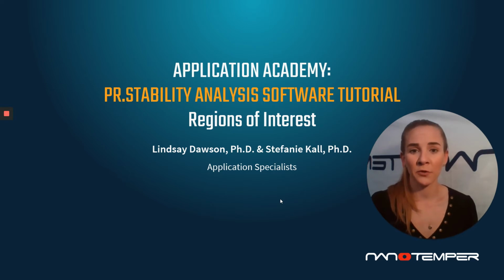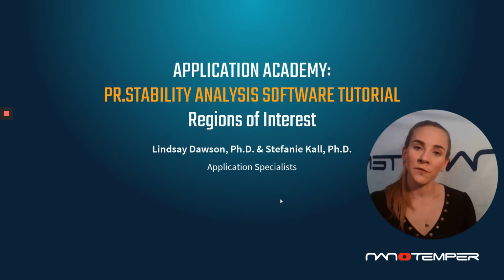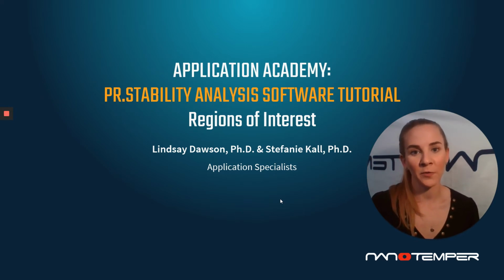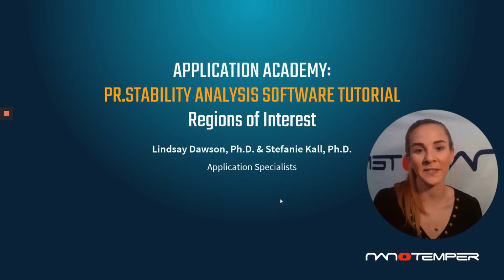We now have a solution built into the stability analysis software specifically meant to help deal with these types of data sets. This is now our region of interest option that's built into the software, which we can select for and apply to a given region to evaluate and capture all of those inflection points that may have been missed. Let's go ahead and jump into the software and see how this works.